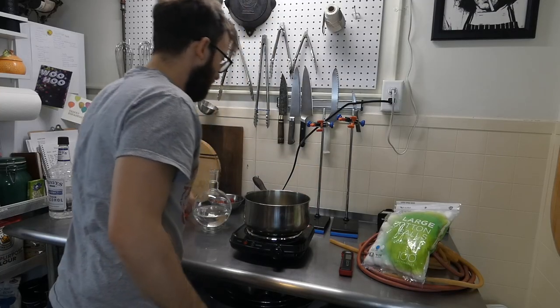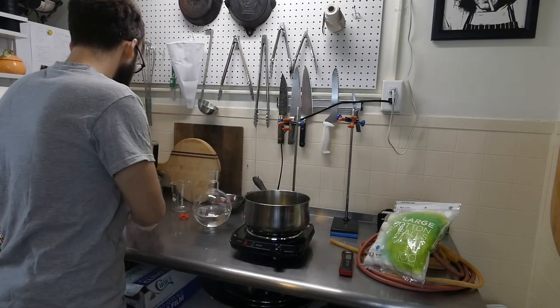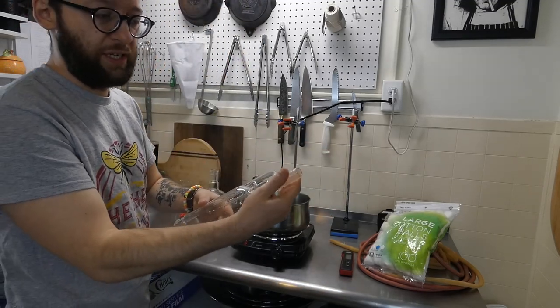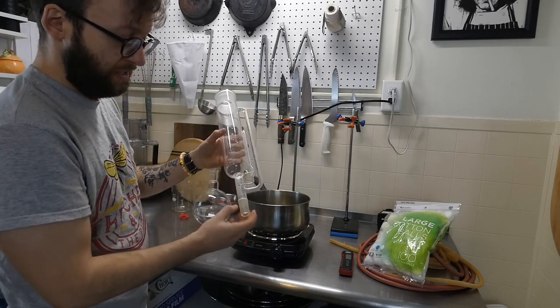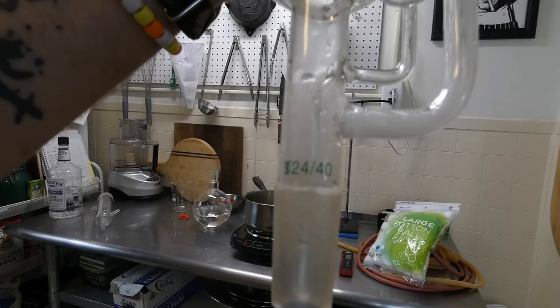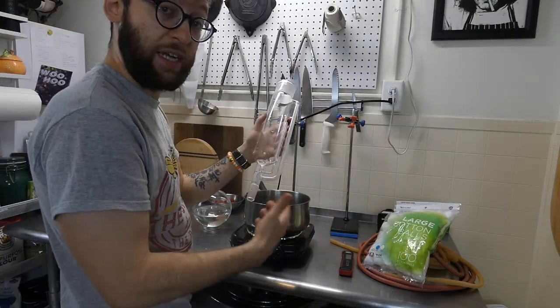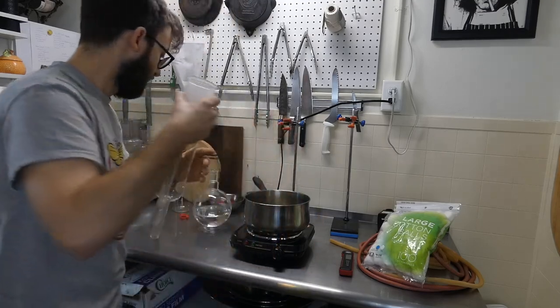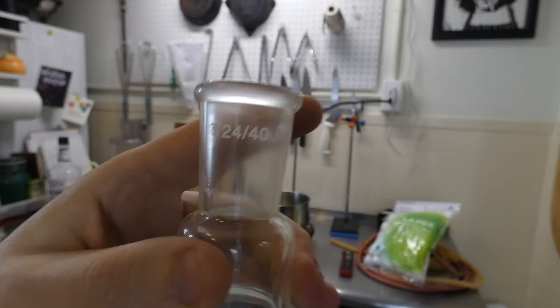So the first thing that we're going to do here is we're going to lube up these joints. Now these are called ground glass joints. Each one has a different size, as you can see here. This one says 24/40. That's just the size of the joint. And as you can see here on the flask, it also says 24/40.